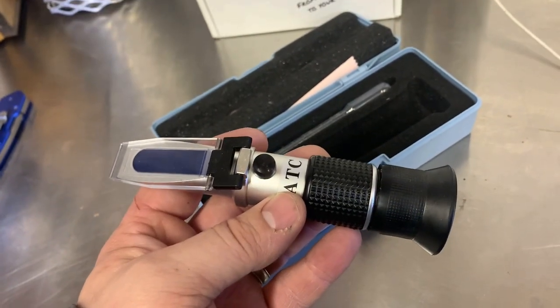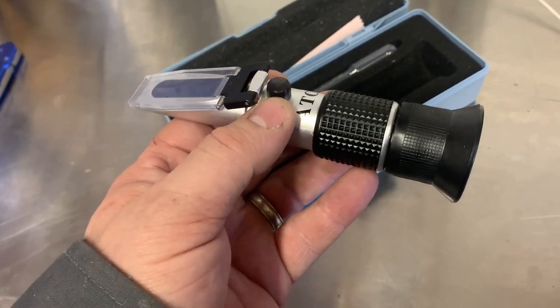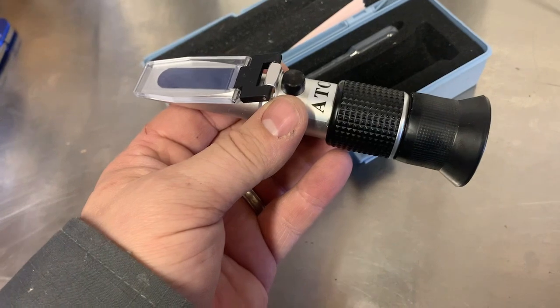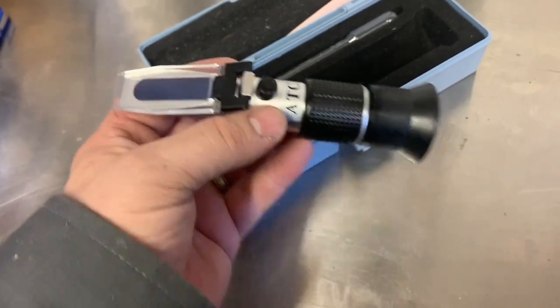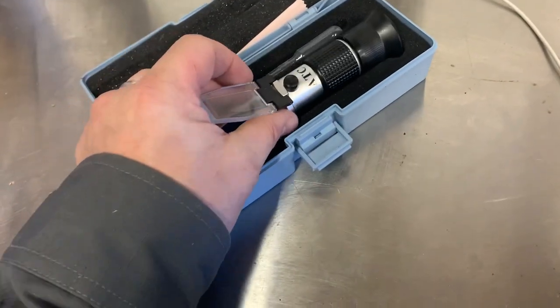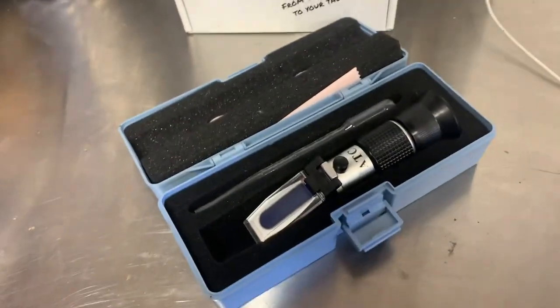You have to calibrate it to make sure that it's set, so the way to do that is you can use oil or water to test it. We're going to also show you what it looks like when we test our honey.